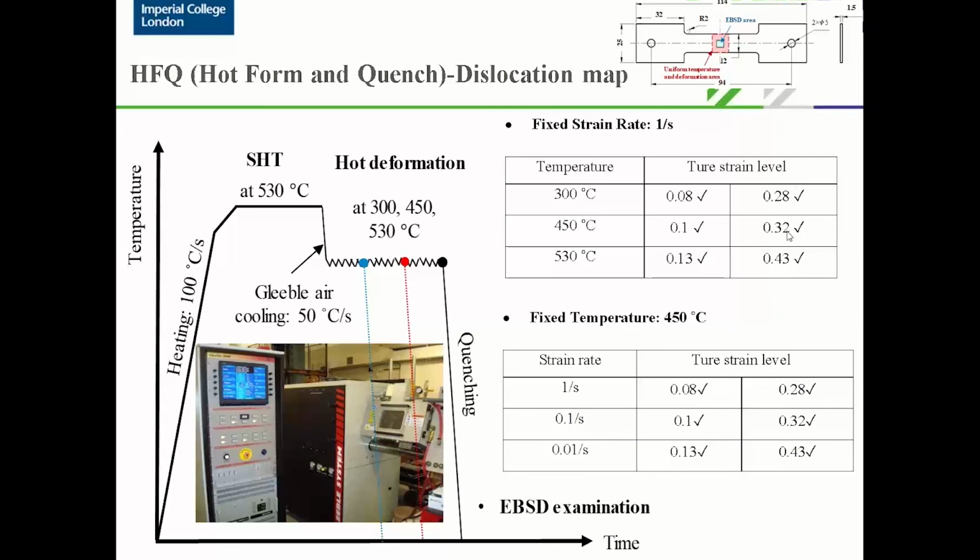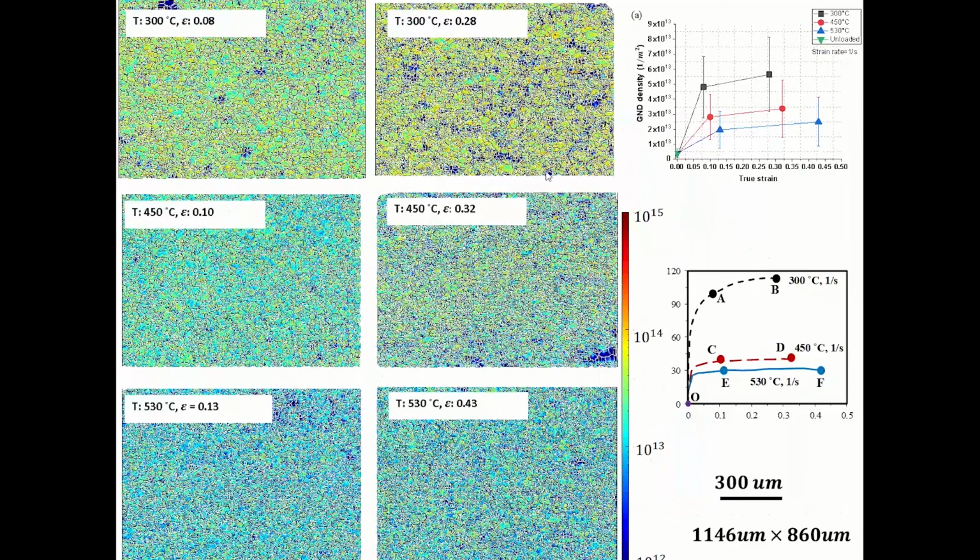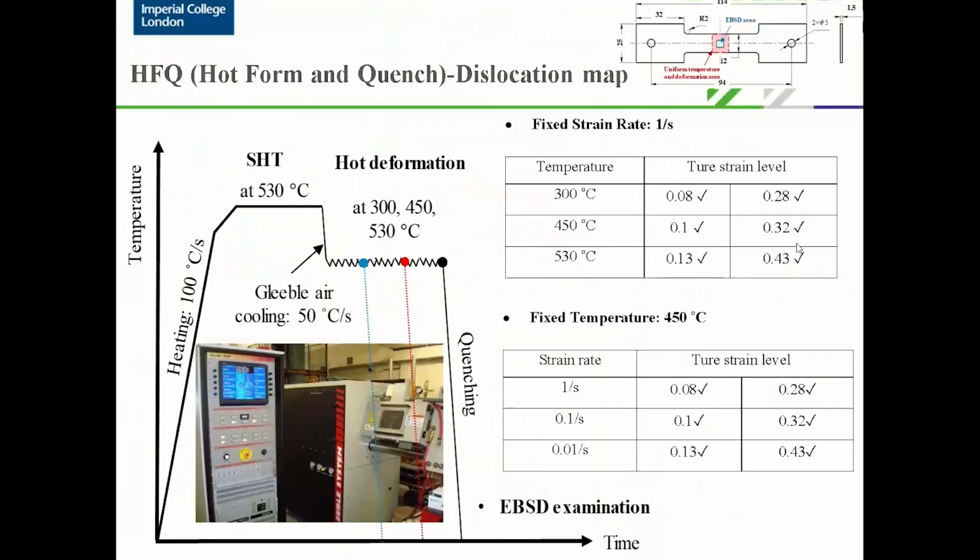But once the deformation level is up to probably 80% or 70%, then we should consider the void formation and the damage formation as well. But from this set of data, honestly speaking, we didn't see the voids from the deformed material, because the deformation level is all within 50% of the fracture strain levels.